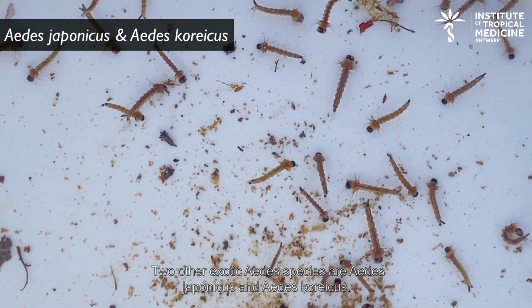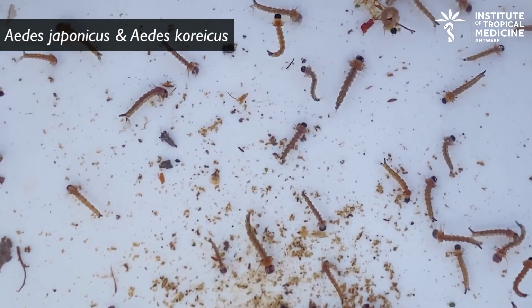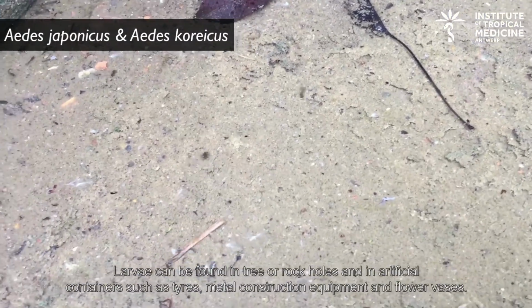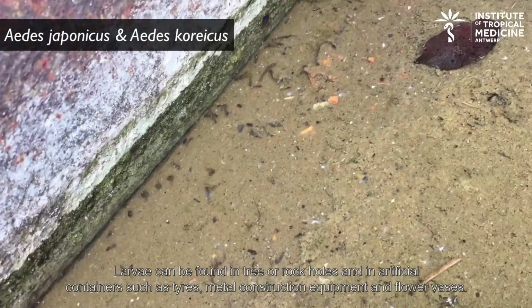Two other exotic Aedes species are Aedes japonicus and Aedes koreicus. Both species are established in Belgium. Larvae can be found in tree or rock holes and in artificial containers such as tires, metal construction equipment and flower vases.